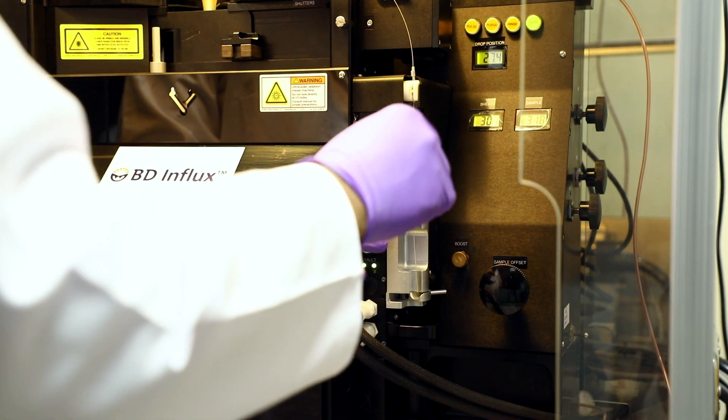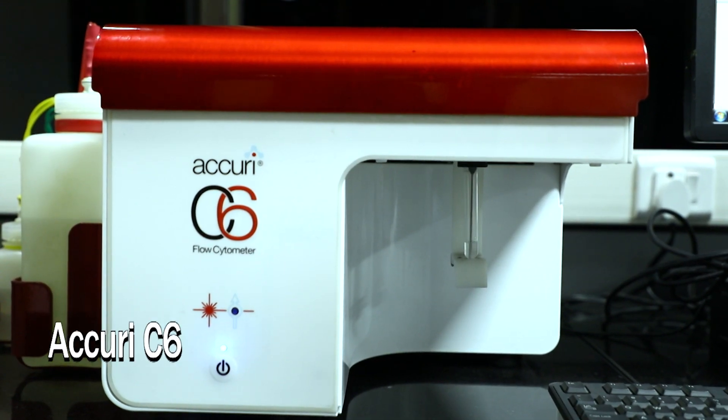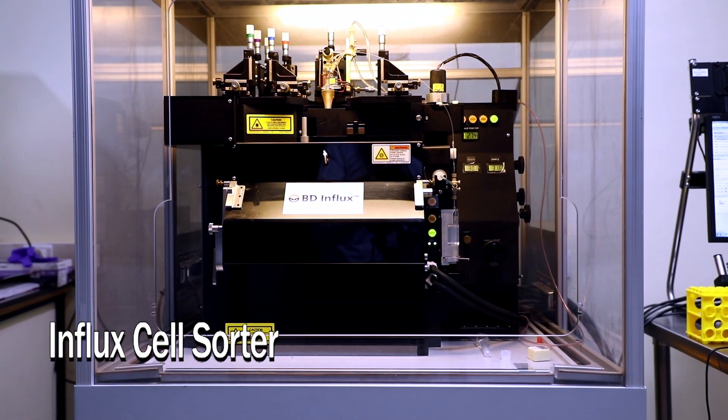The facility is equipped with high-end instruments such as the Faxverse, Acuri C6, Influx Cell Sorter, Galios.